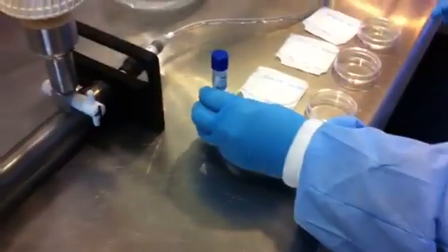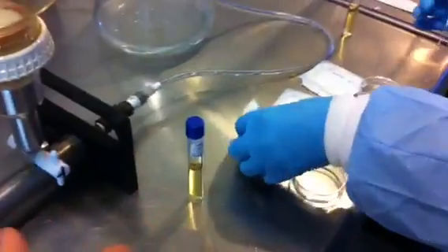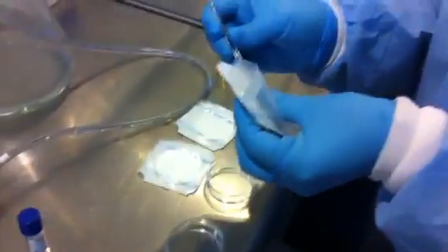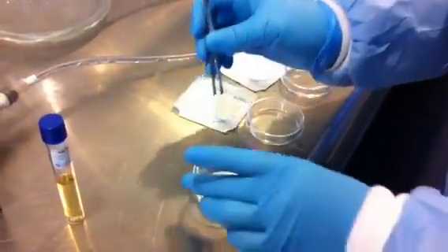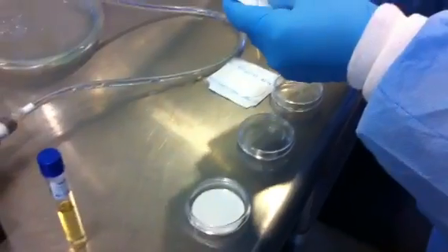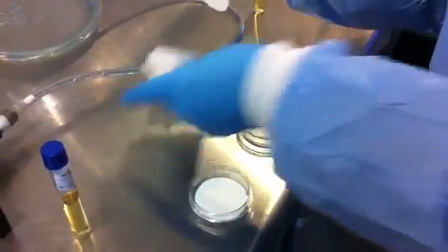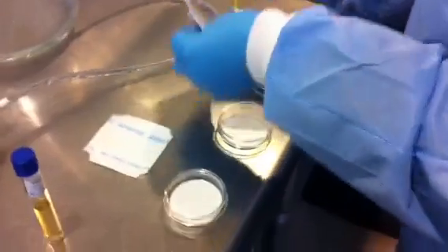At this point, we want to add two mils of the solution that we're testing. This tube could be an ampule of media — usually it's an ampule. She's putting the absorbent pad down into the empty petri dish. This is one way to do it.